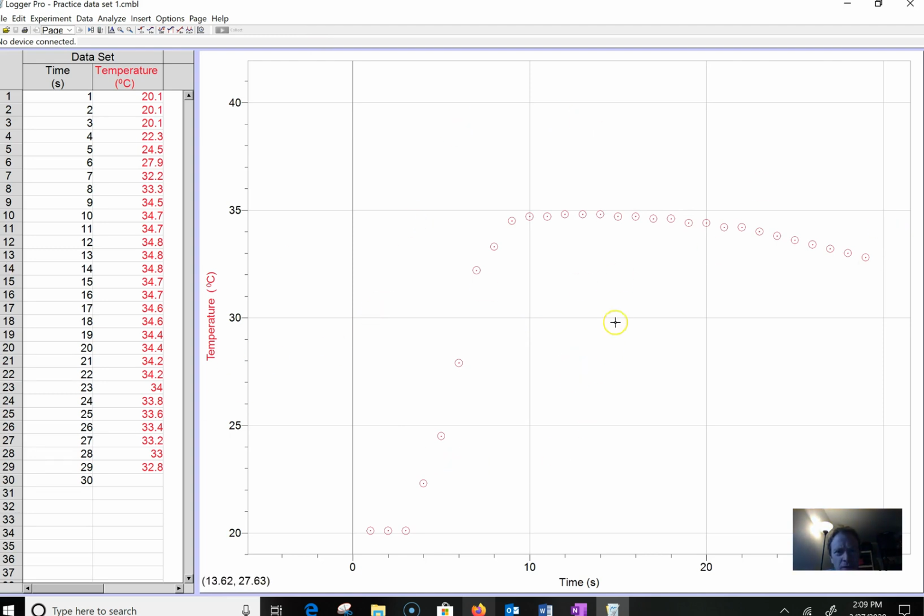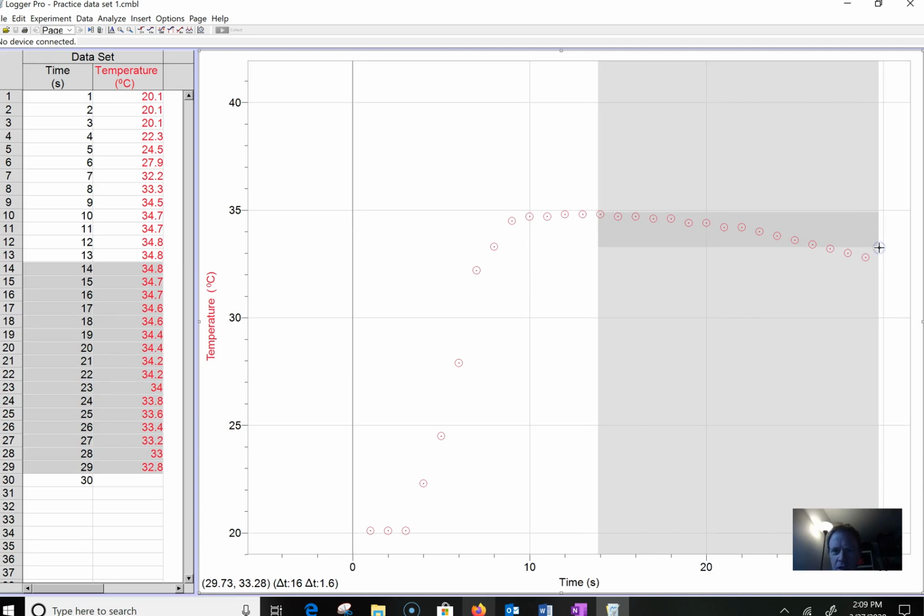And you can do so much stuff with this software, but this is just the tip of the iceberg. I'm going to try to find about where the temperatures start decreasing. And if you were able to download the program, you're probably doing this with me to some degree. I realize you're watching the video, but a little bit of back and forth would be good. I'm going to try to find about where the temperatures start decreasing.